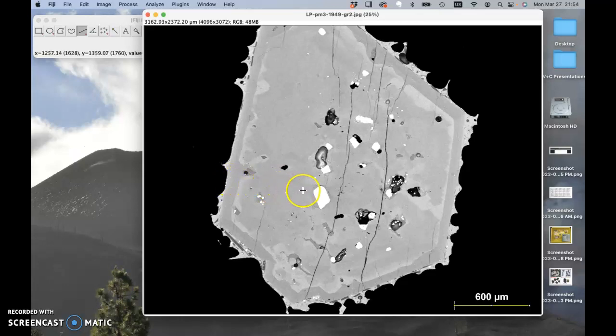And this region of the crystal is pretty clean. There's no inclusions in the way. And there's no cracks either, okay, or holes. So I might select this area from the rim to the core, okay, perpendicular to the crystal face, if possible. Okay, you see, this is a right angle between my profile and the crystal face. I draw that line, okay? This is a pretty good line.